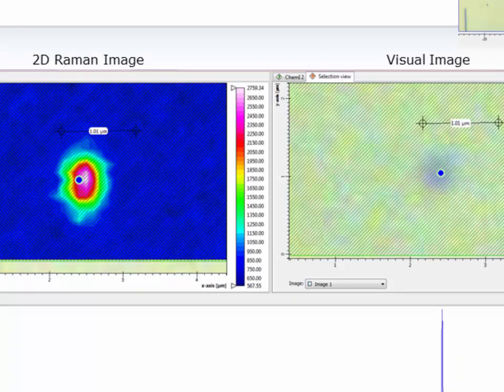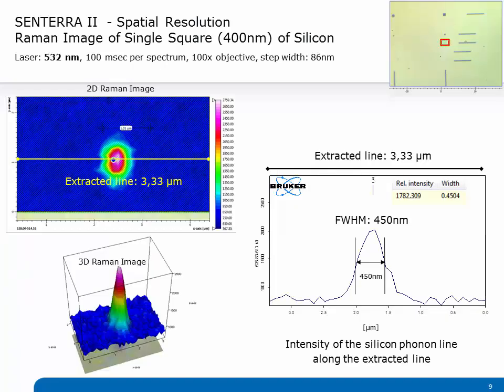To come to a more challenging task, we measured a 400 by 400 nm square of the PTB standard. As you can see, we were still able to resolve the square. To examine the resolution test to its full extent, we extracted a line across the square. Due to optical effects and the convolution of the band, the best achievable resolution is actually 450 nm, as you can see in this slide.